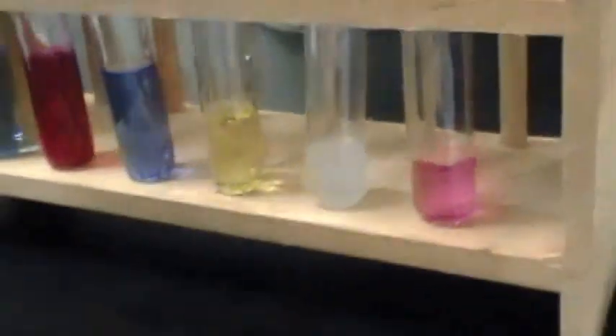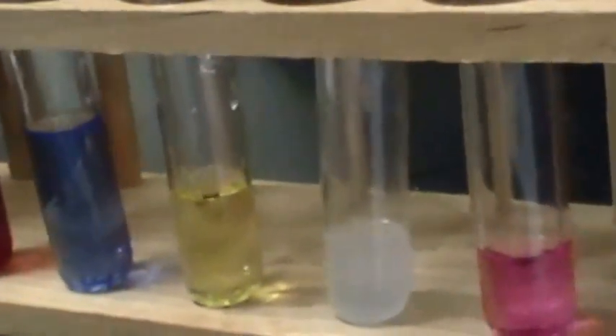Alright, so one milliliter — no change. Two milliliters — light blue change, but after we stir, no more blue. It's kinda tinted blue, only if you squint. It all disappeared.